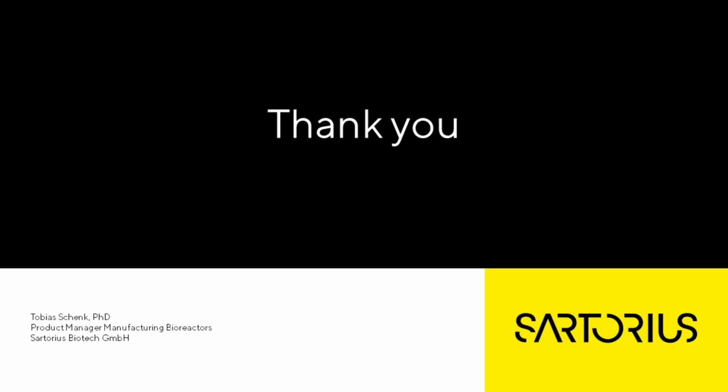The last question for the webcast is, in the last slide, if I understand well, you mentioned there is no temperature reduction for rocking motion bioreactors. Could you explain this point in detail? Yeah, maybe that's a good last question indeed, because when I talked about cooling options so that we can actively reduce the temperature, currently that's not possible with our current rocking motion bioreactors, because it doesn't have active cooling. We have only active heating. Our stirred bioreactors, they have both technologies, cooling and heating embedded.